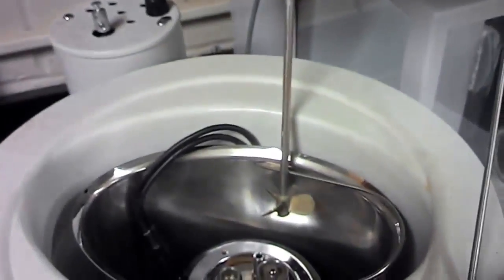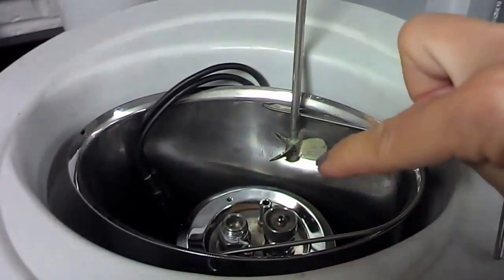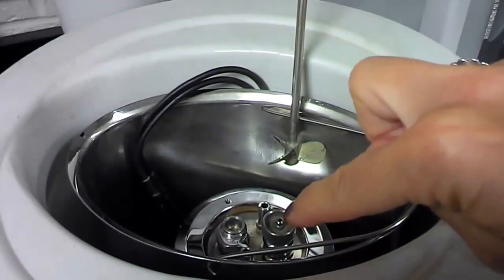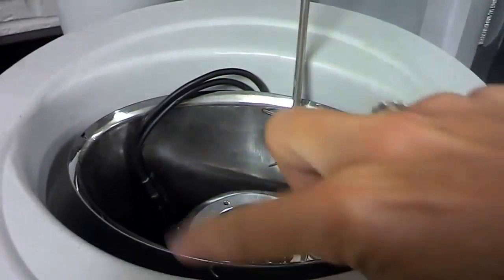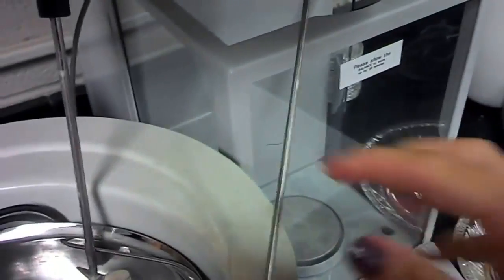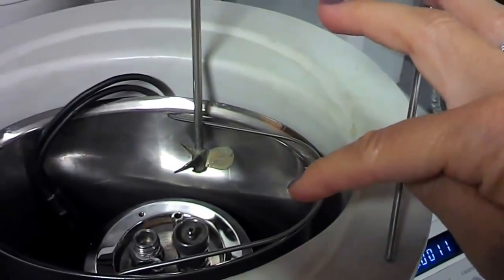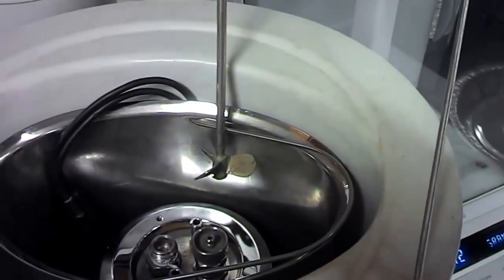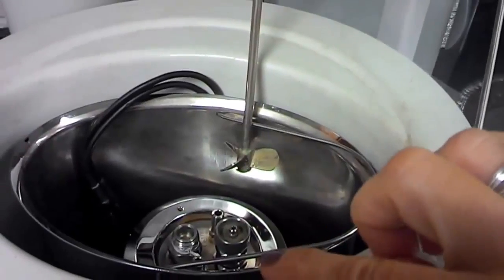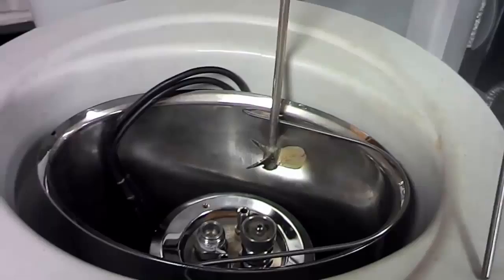The stirrer is going to stir the water that's in this big pool here, so that the heat given off from the sample is going to warm the water in a uniform way. This is the temperature probe. This goes down in the water also and measures the change in temperature, because as the sample is burned, it'll give off heat and the temperature of the water will increase.